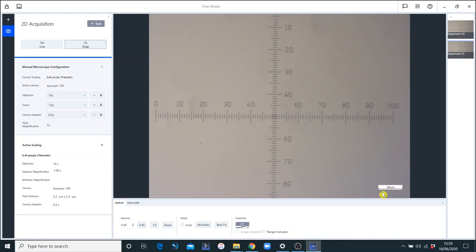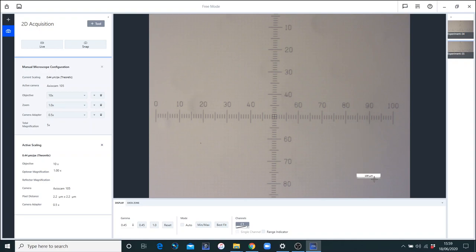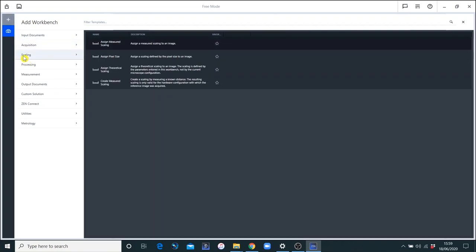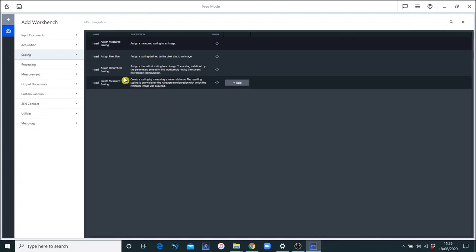You can see how here it pops on a scale. If I measure this, move this scale bar up, we're already pretty accurate with the theoretical. But we want to improve this to be measured. So I'm going to add a workbench, and that workbench is under scaling, and it's called create measured scale.